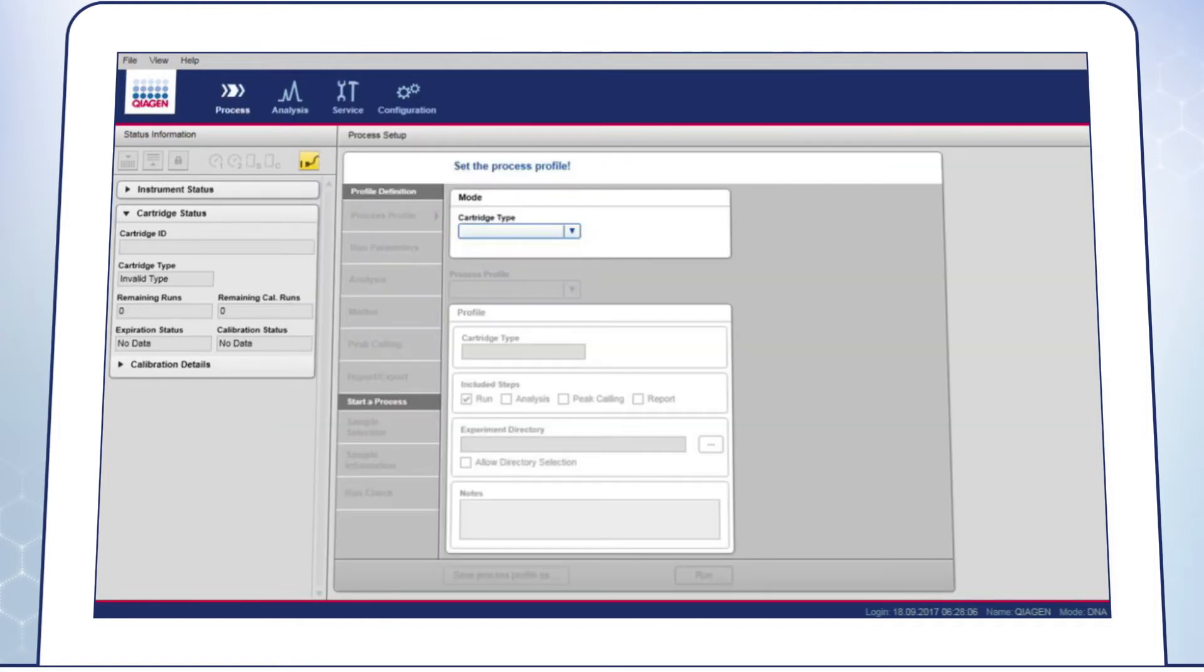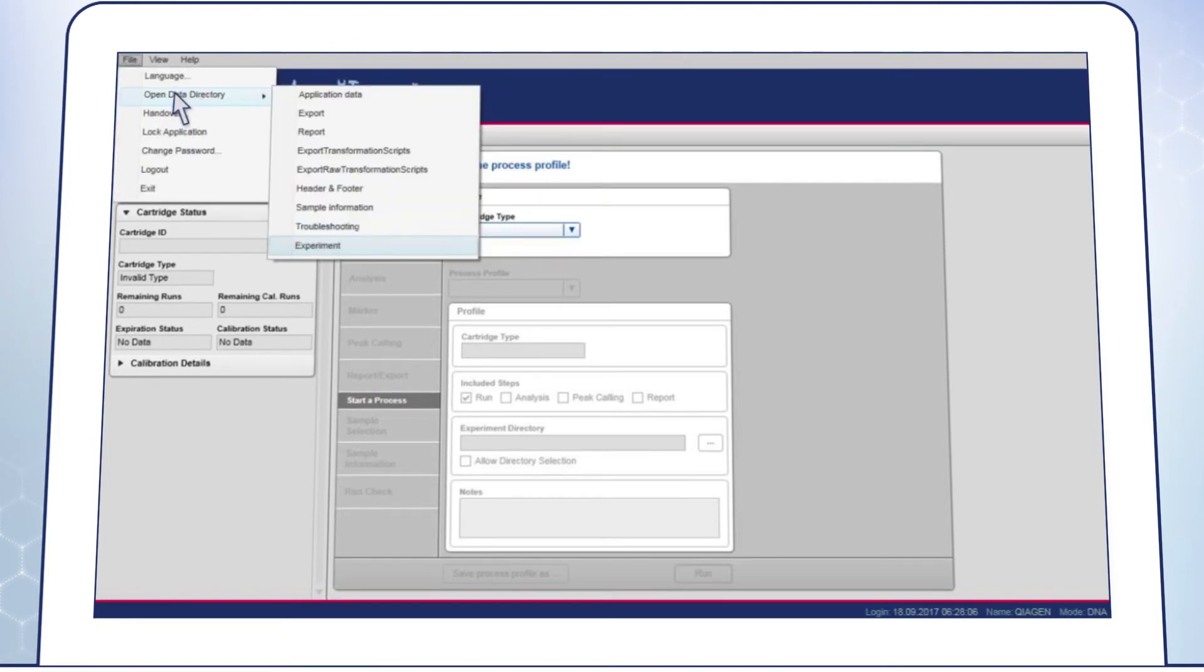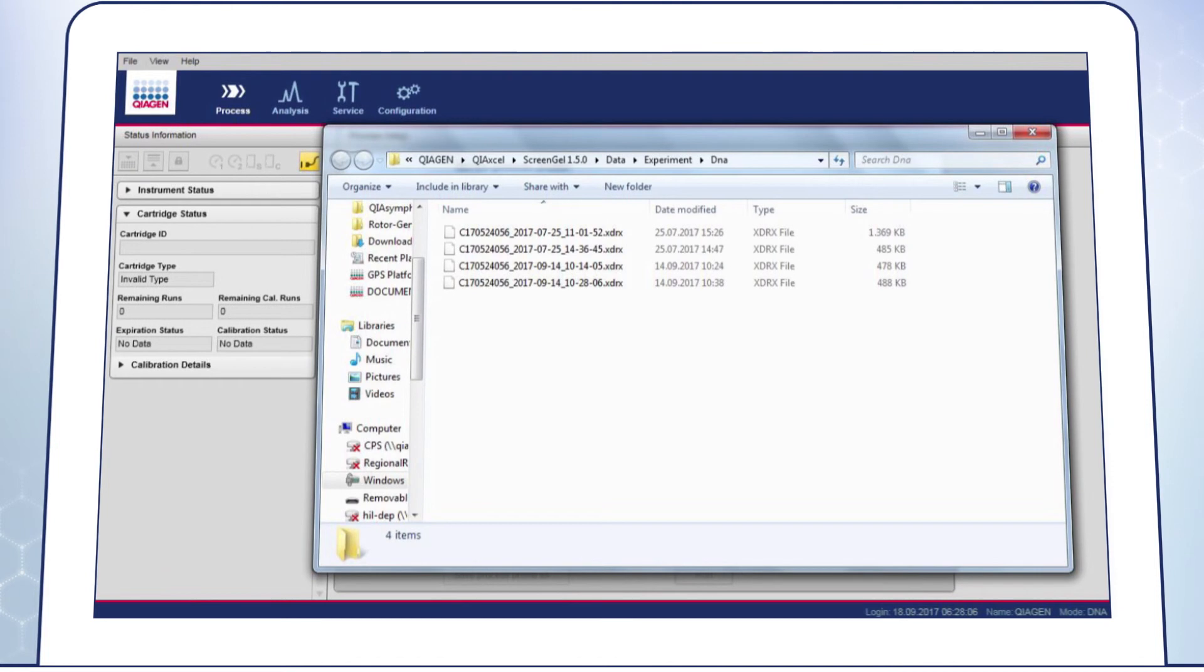2. Experimental Data. In case you observe calibration or analysis issues, send us the appropriate experimental data. Go to Open Data Directory Experiment and select the data to be attached to the email.